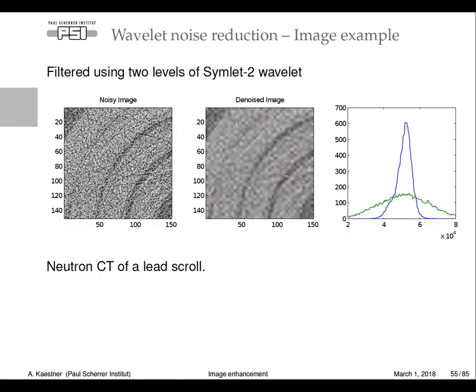And here's an example. So this is an original image, pretty noisy. I apply, there is a huge catalog of different wavelet bases, the ways of transforming. And they have some characteristic features, they have different sizes to make them sensitive to different characteristics of the images.